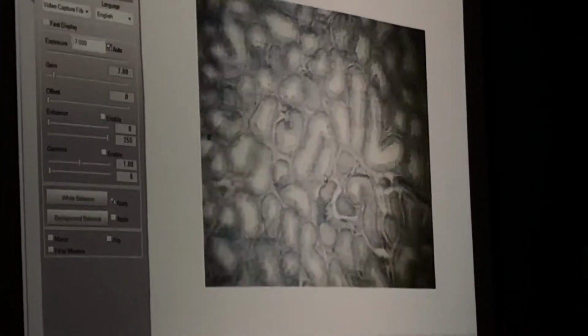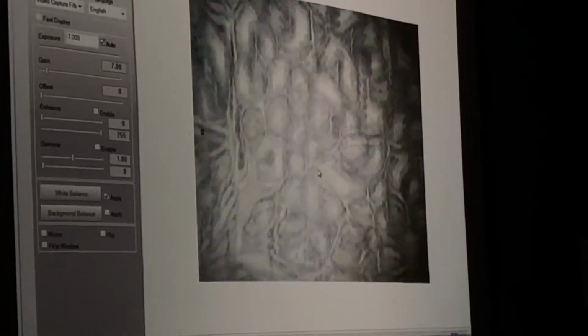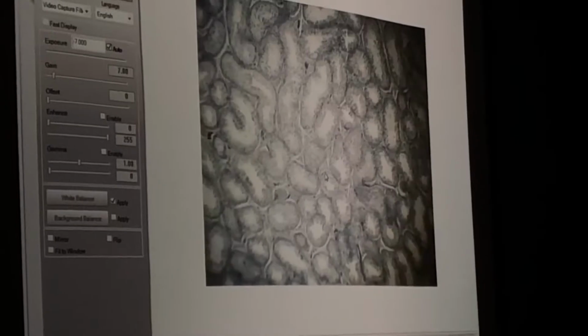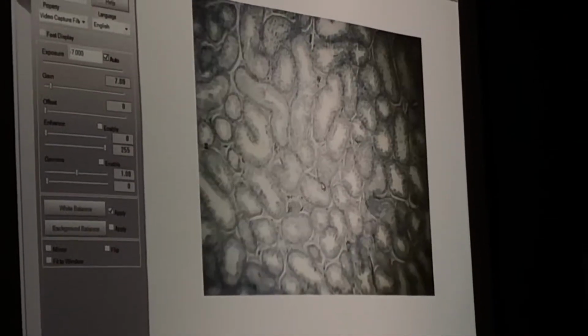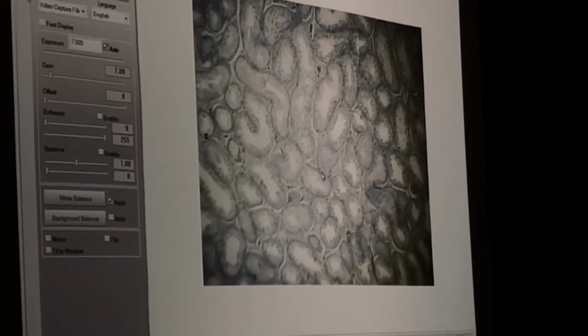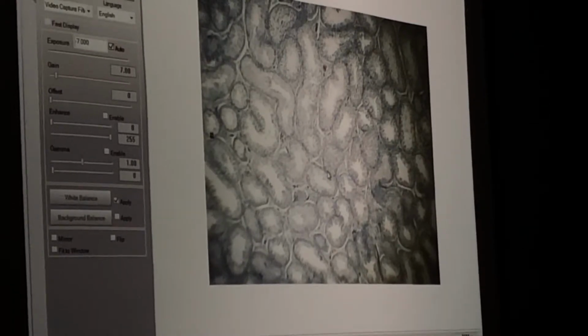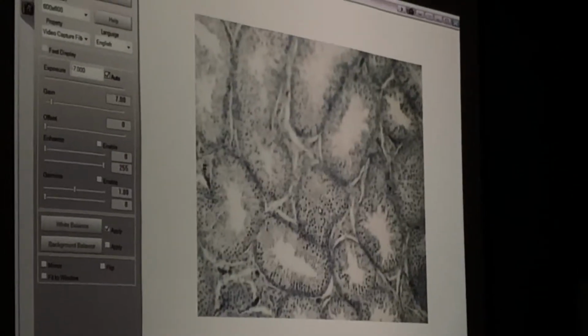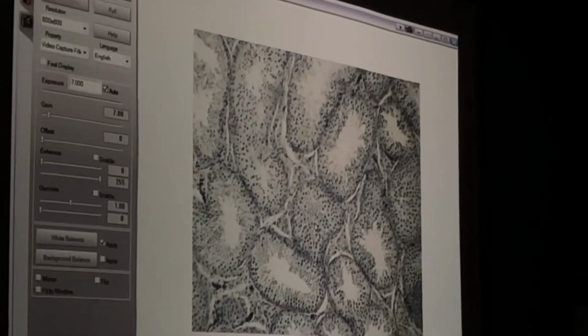So if I just look through here, I don't see anything that looks like I'm really dividing it into chunks or sections or anything like that. Okay, so no septum that we're going to see in these. All right, these little tubes are going to be cross sections through what? Seminiferous tubules. And why do we care about seminiferous tubules? What do we do there? Make sperm.